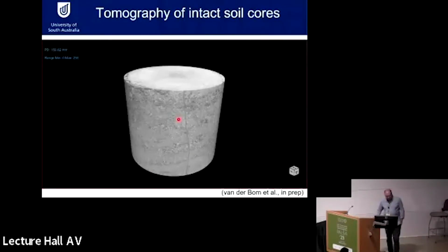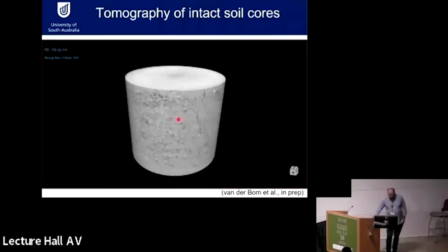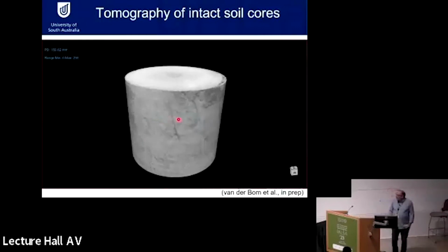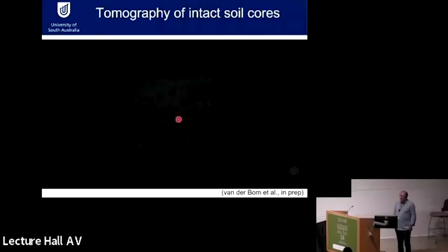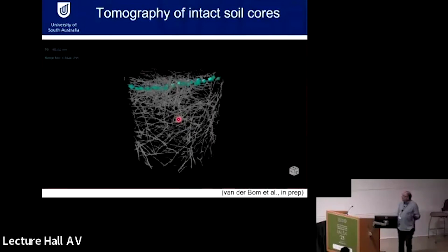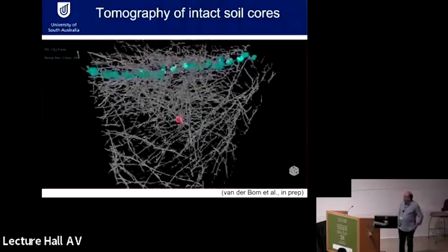Let's see if this one works. So that's the soil core. Of course, it looks quite dense, but you can filter out most of the things. Even so, it's very difficult because you have solid, you have water, you have porosity, and so on.